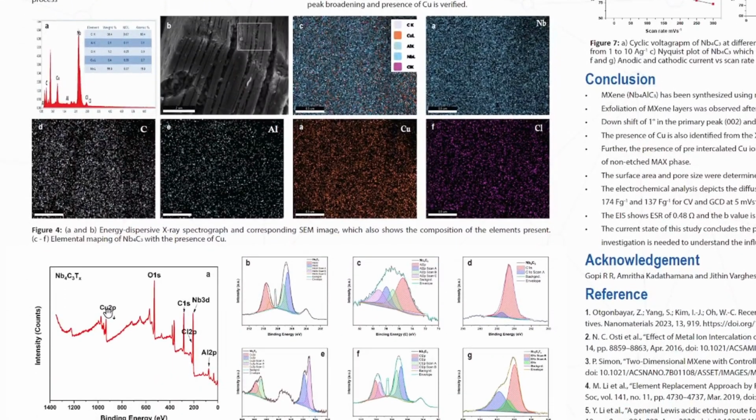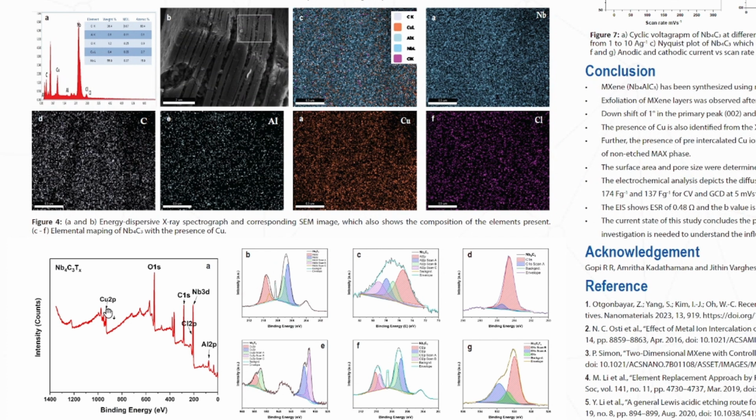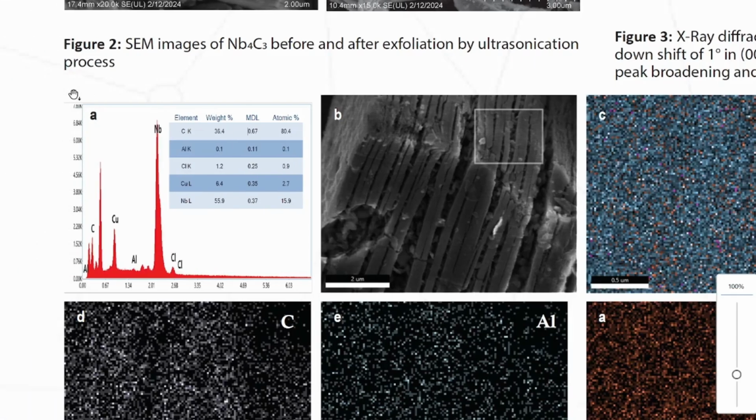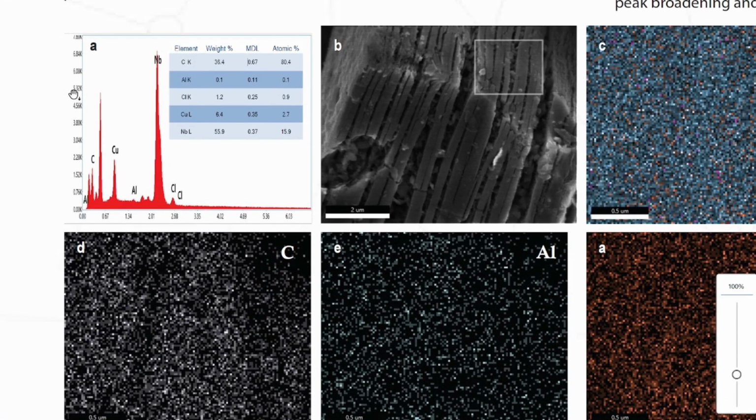To further confirm the pre-intercalation of copper ion, EDS and XPS are performed. From the EDS, we can see the composition of the elements as well as the presence of Cu. The presence of Cu is around 6.4, and the presence of Cl is 1.2, which is not equal. So we can possibly say that the chlorine is terminated on the surface, and Cu may be intercalated in between the layers.